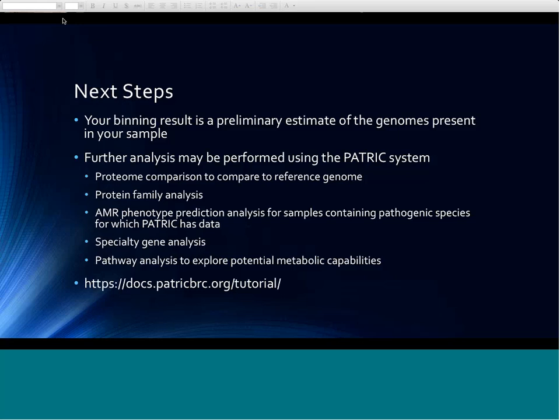Okay. There's also a question or a comment here that we didn't show the contig results. The contig what? Results. I'm not sure what that means. Okay, in other words, we didn't show which contigs were in each bin. I'm going to check.